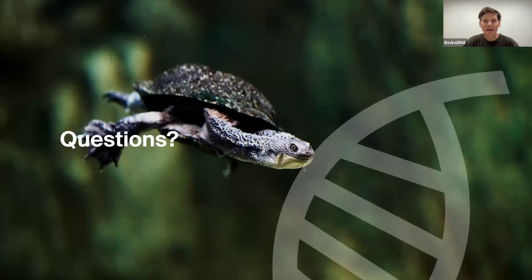So at this point, this is really just a technological introduction to the main tools before we get on to interpretation, and we could stop quickly for a few questions here. Thanks, Luke. We've had a few questions come in. So the first one is, what other substrates can be used? Filtered water is obvious. Scats, claw marks, what other options are there for terrestrial species?